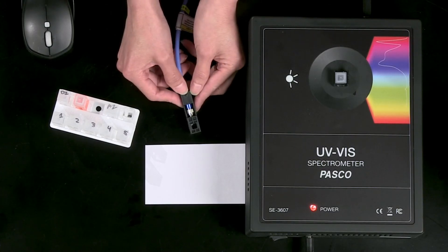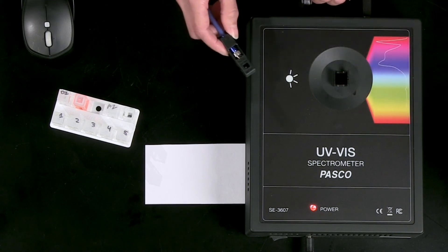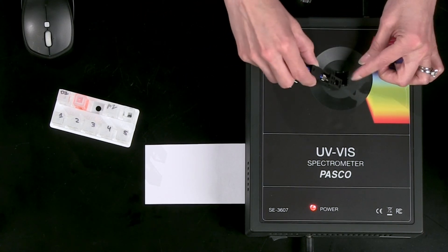To properly position the fiber optic cable, find the triangle on the cuvette housing and line it up with the notch on the cuvette holder on the spectrometer.